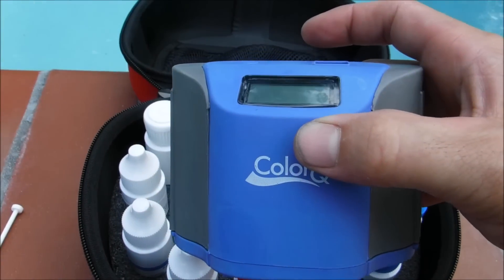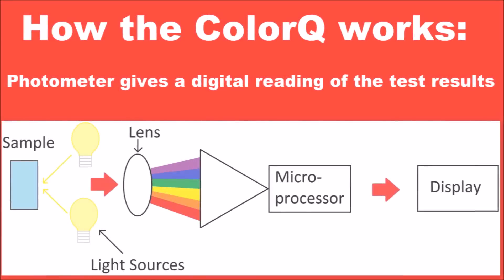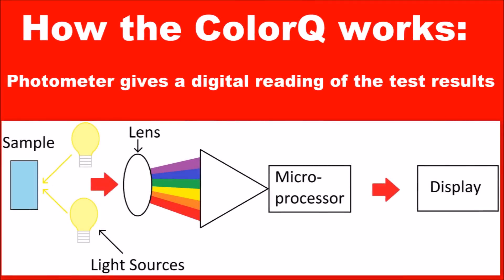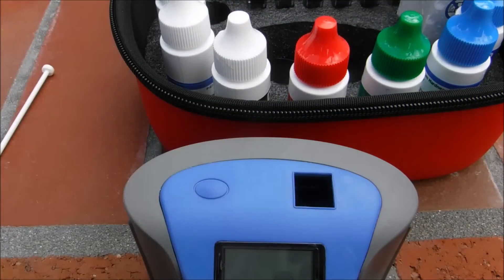This is the ColorQ unit itself — this will do the electronic testing. The ColorQ Pro 7 uses a photometer to measure the light intensity of the water sample with the reagent in it. It then gives you a numerical readout on the display. Included is a water sample bottle you're going to use for all the tests.